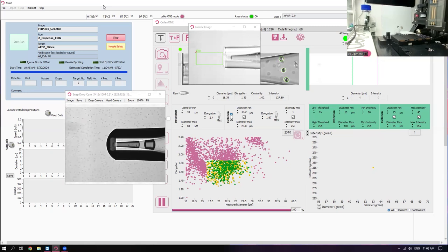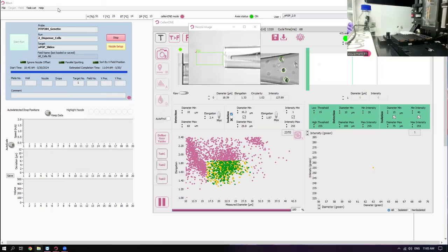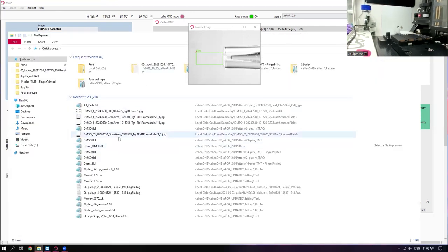So, all right. So now it's scanning with the camera. Yep, mainly for our diagnostic strength. You can only have as many nozzles really as you have syringe pumps.